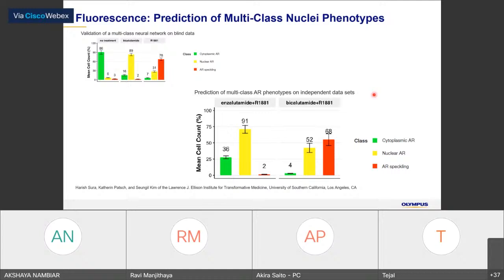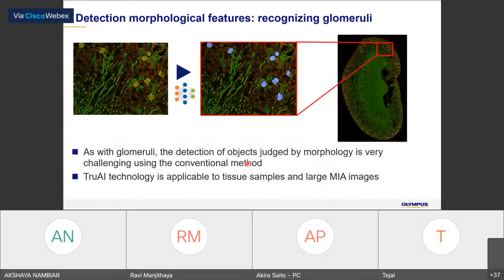And by using validation on those kinds of images, we can find out whether this neural network is valid or not, and also apply it to the real sample and see that this one has more AR speckle cells compared to these samples. So this kind of analysis can be done.